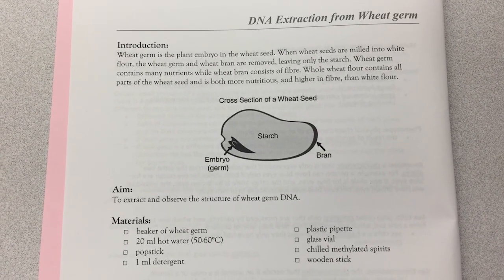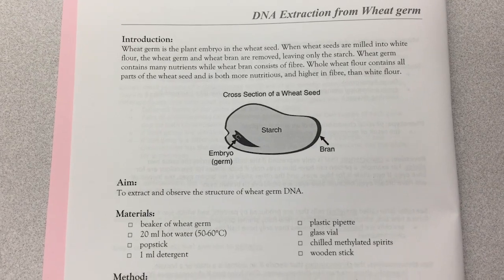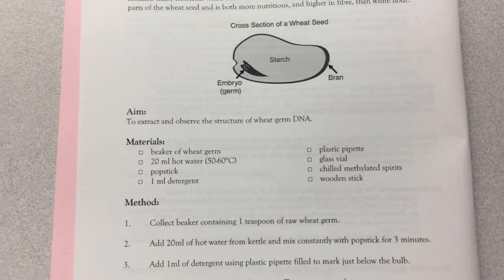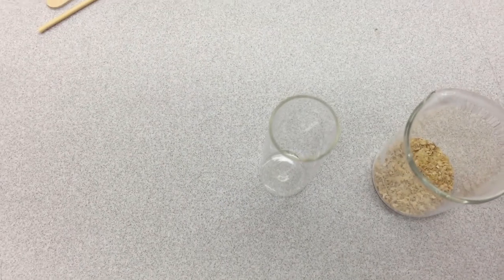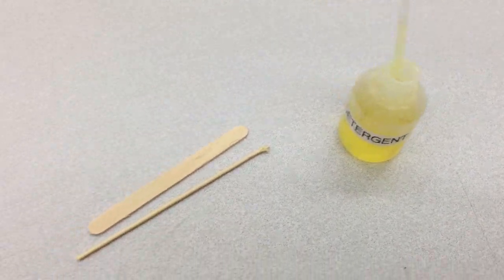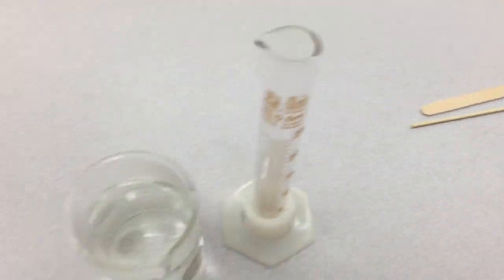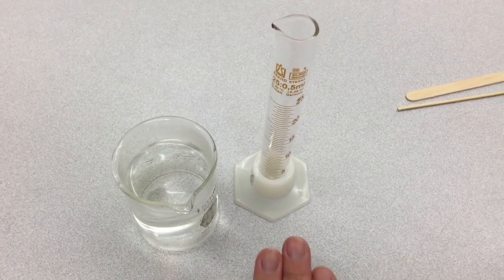So you'll see our aim is to extract and observe the structure of wheat germ DNA. We have a certain collection of materials: a beaker of wheat germ, a glass vial, some detergent, popsicle stick, a beaker of hot water, and a measuring cylinder.